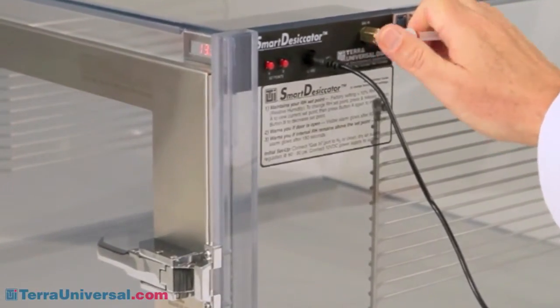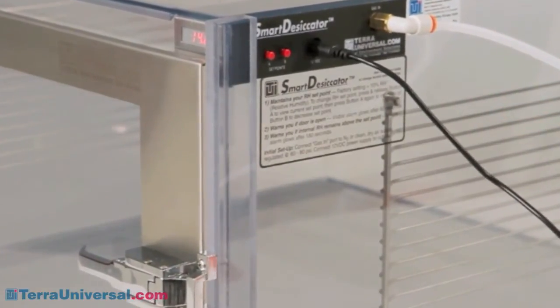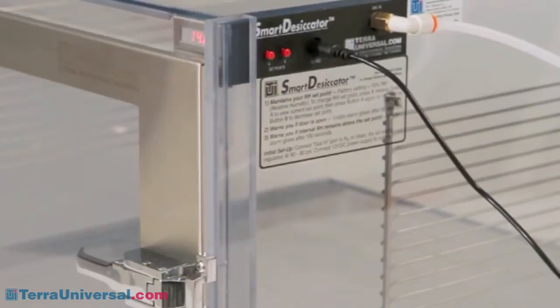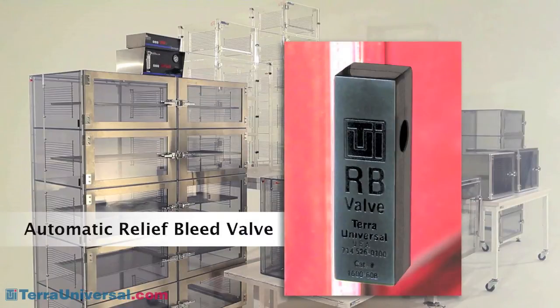Smart desiccators are available in one and two chamber configurations in acrylic, static dissipative PVC, and stainless steel. For the most critical RH control requirements, Terra offers a NitroPlex system which provides independent chamber-by-chamber humidity control. Gas exits the cabinet through Terra's unique automatic RB valve — by installing one in each chamber, you ensure that moisture that enters when a door opens exits the same chamber without migrating throughout the cabinet.